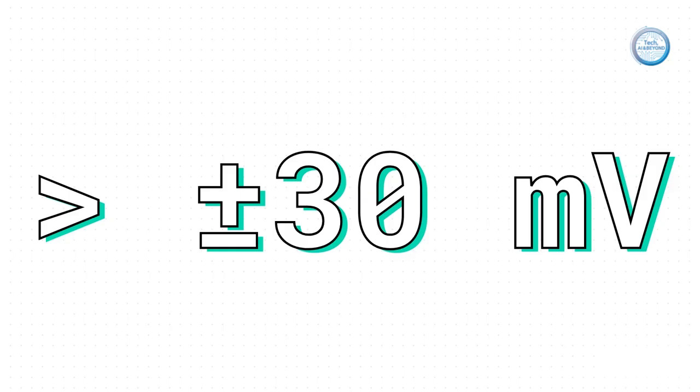The first one here is zeta potential, with this benchmark of plus or minus 30 millivolts. So if I have nanoparticles floating in a liquid for something like a drug delivery system, what stops them from just clumping together? How does this number help? You've just described the exact reason for this technique. Zeta potential measures the electrical charge on the surface of nanoparticles when they're in a liquid.